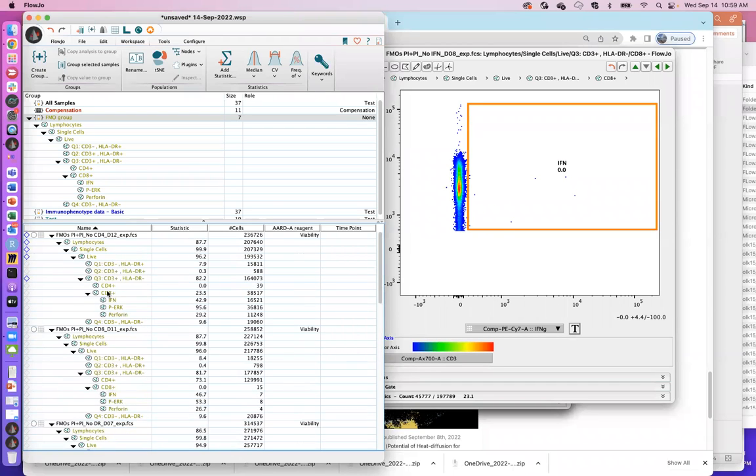Okay, now what I've done here so far is I've isolated CD8 T cells that express interferon, phospho-ERK, or perforin. Okay, but what if I wanted to know if I had CD8s that expressed all three of these markers, or perhaps positive for two and negative for another, right? How do I arrive at those? Well, you can create very convoluted 2x2 gates, dragging these guys underneath one another to get to what you want. But there is a faster way of doing that.